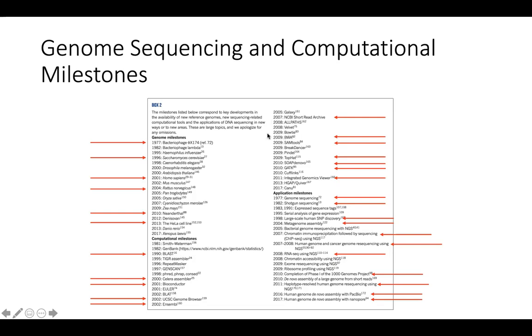Then the Burrows-Wheeler Alignment tool, BWA, we're going to use this tool. We are going to use SAMtools for detection of variants. We're not going to use TopHat, but it's a tool that is used also for alignment. We will not use SOAPdenovo, but it is a genome assembly tool. I don't think we will use the GATK, the Genome Analysis Toolkit. It's a suite of software.